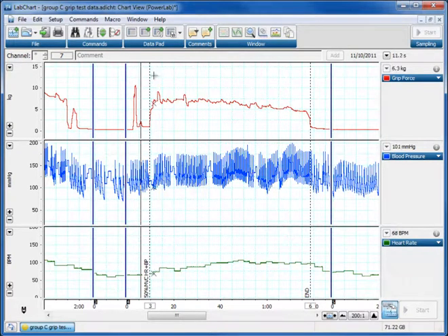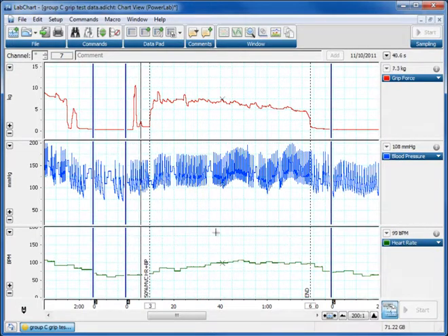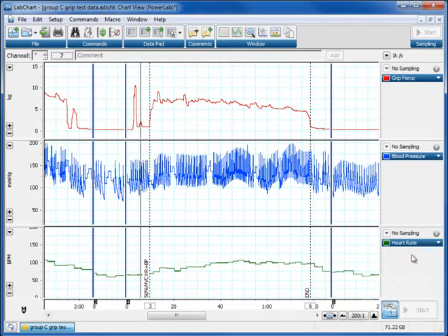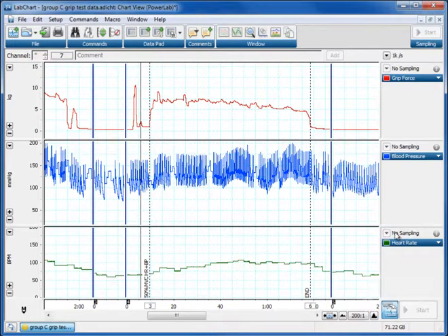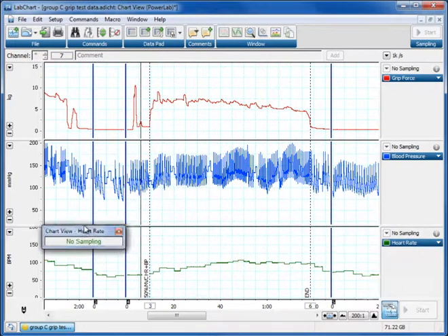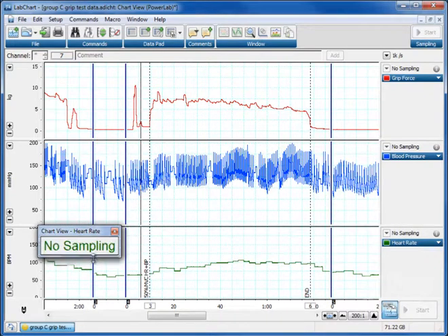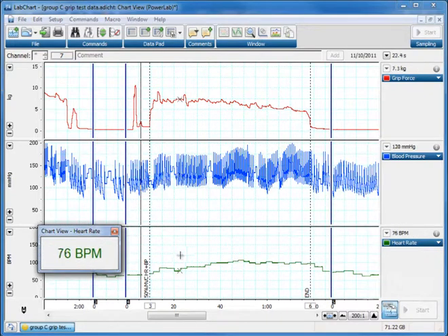A DVM window is very easy to create for any channel. We've got three channels here, so we can create a DVM for each one. You just click your mouse over the selection box above on the top of the channel here, drag and drop, and it creates a DVM window.